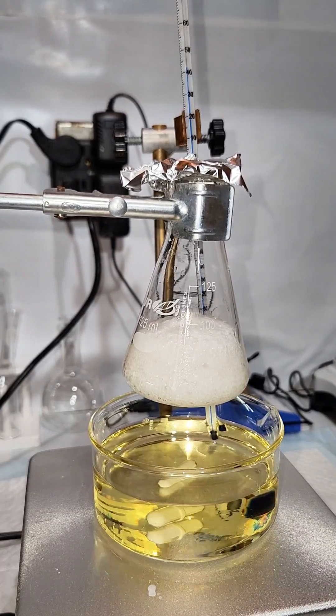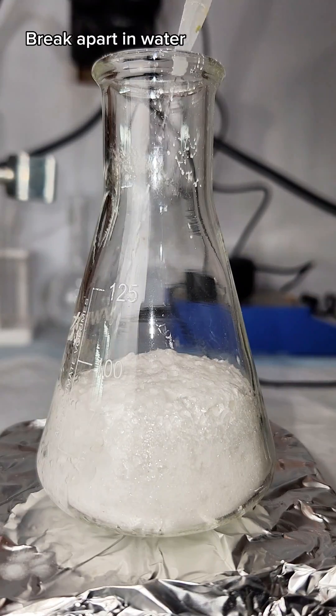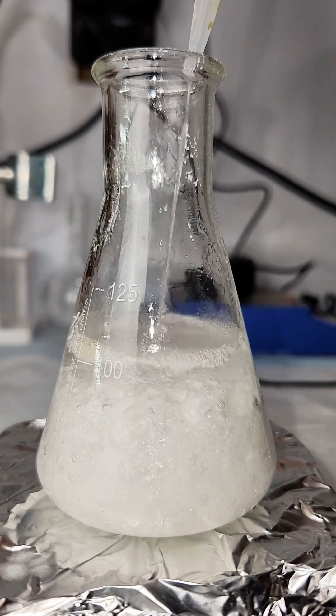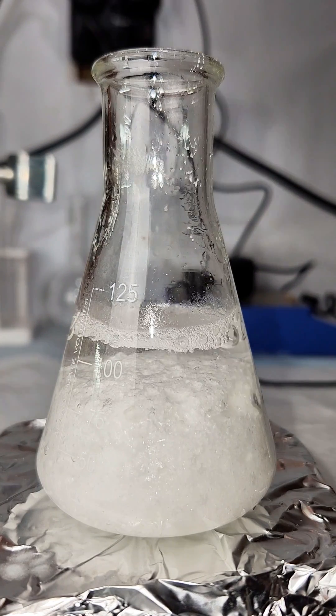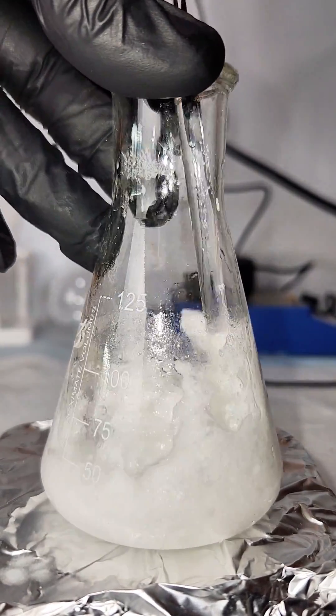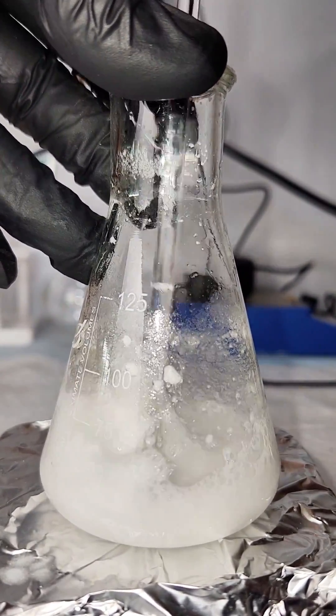Once it's all cooled down, I remove the phthalimide from my Erlenmeyer flask by squirting in some distilled water and then breaking apart the mass with a glass stir rod. I then pass it through vacuum filtration to collect my phthalimide. Since phthalimide is virtually completely insoluble in water, I really shouldn't lose any product here.